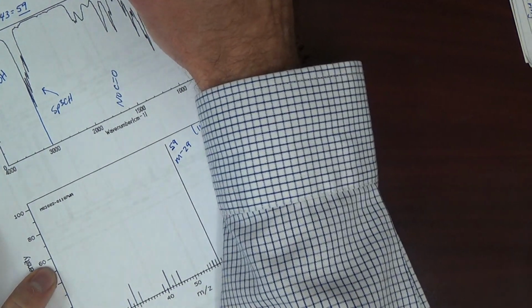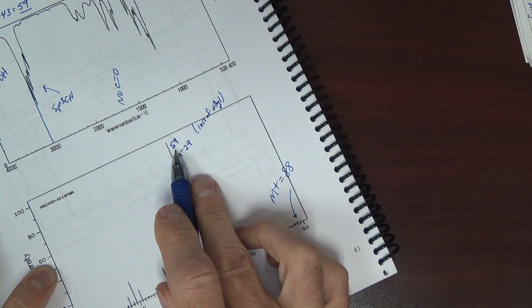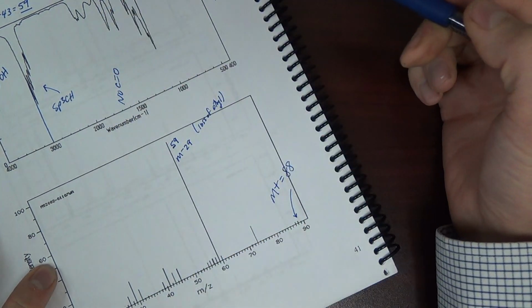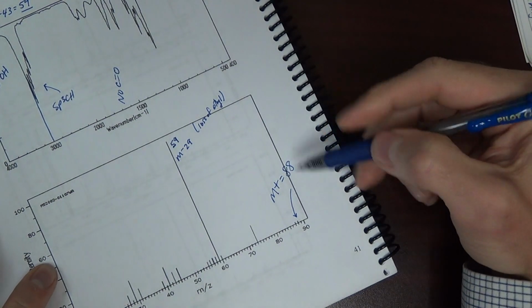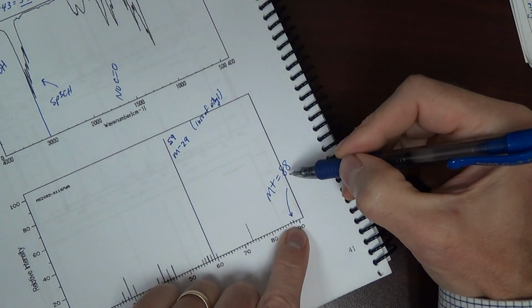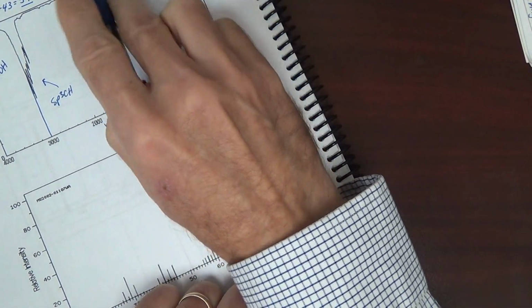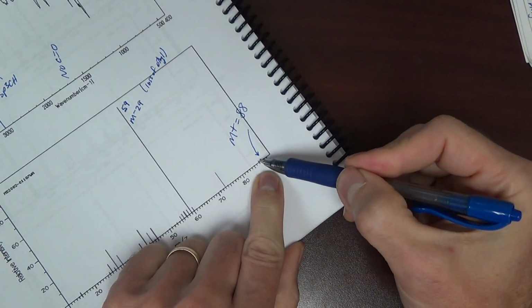Certainly I think we've excluded this one because loss of 43 would not give 59. It would give like 45. But again, I'm going with F because I'm assuming that the molecular ion would have been shown. We also have an 88 here. The 88 would be the molecular ion. This compound you would not expect at 88, although it is quite small.